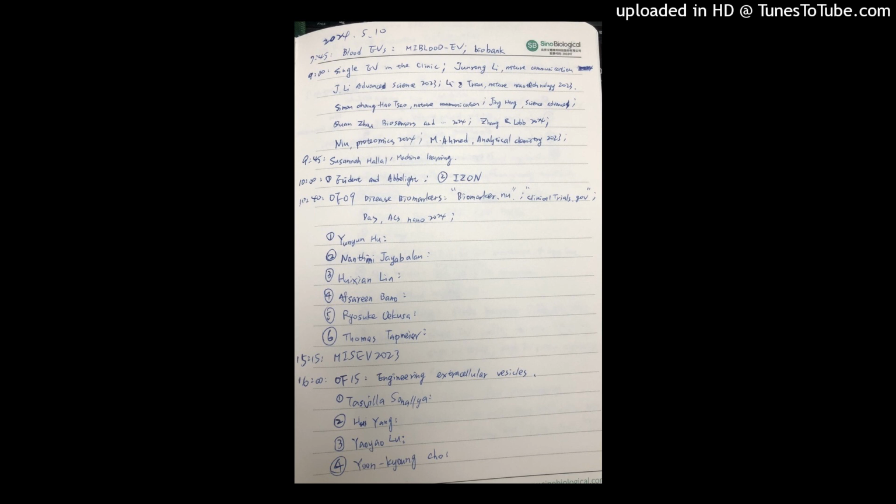The other question was about urine and other body fluids. Well, I think the most important thing is that there is becoming a sort of awareness in the EV field that measuring EVs is difficult and isolating EVs is difficult. Right now, there's not a single method that can isolate or detect all vesicles or exclusively vesicles. It's really very challenging because the vesicles are present in a soup of other stuff.